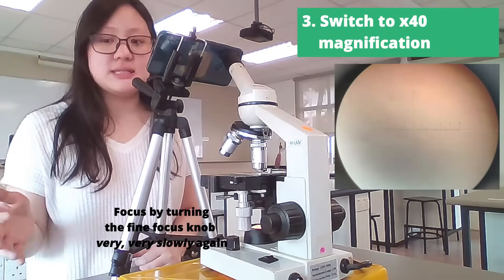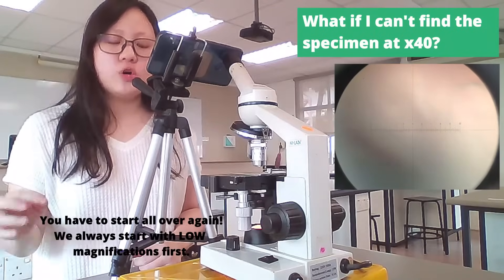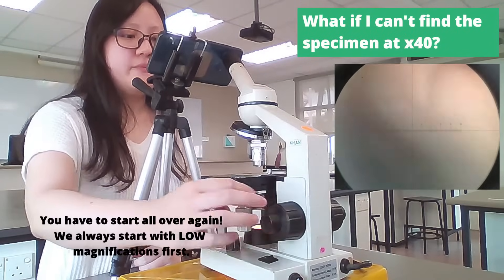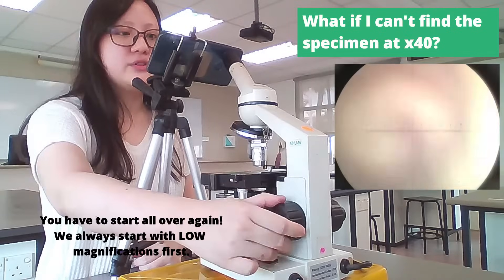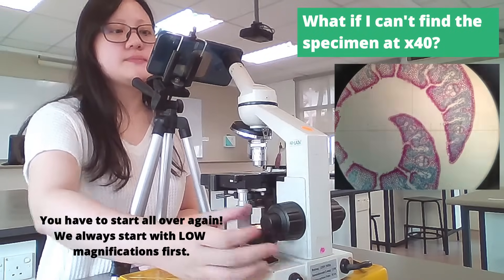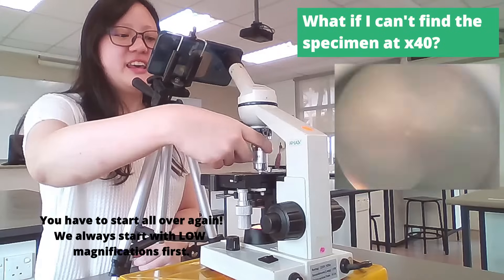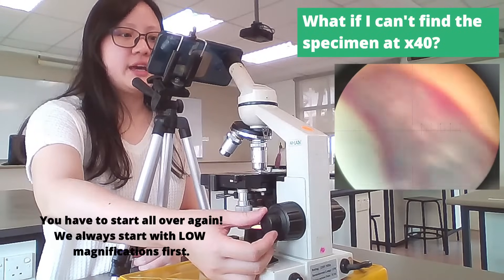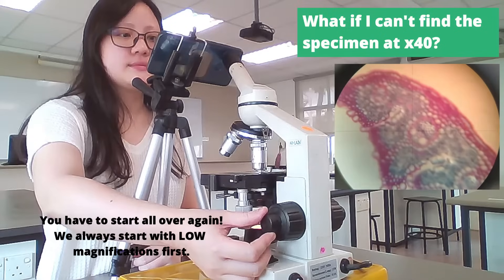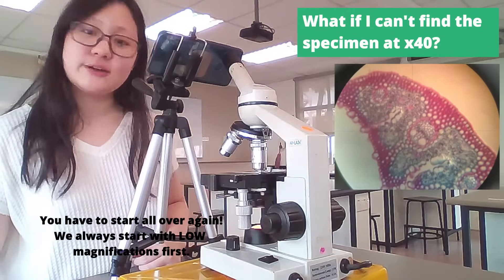When this happens, please go back to 10 times magnification. Always focus at the lower magnification first, and return the stage to its highest level, and then slowly focus on the specimen again. Then switch it to 40 times and very slowly turn the fine focus knob again until you see your specimen. And this is how you focus on a specimen using the microscope.